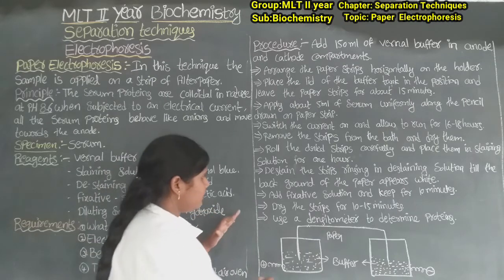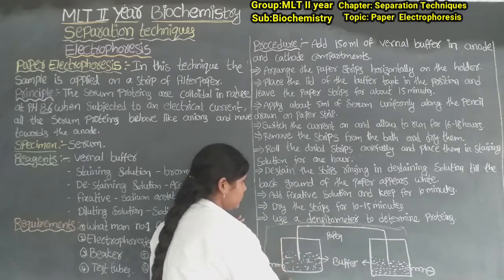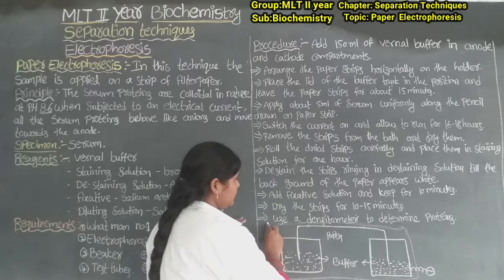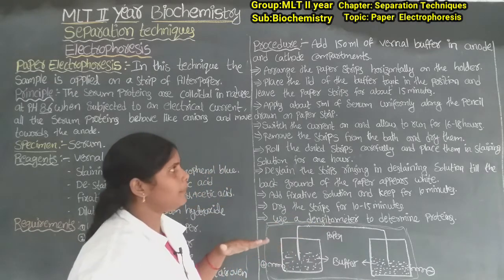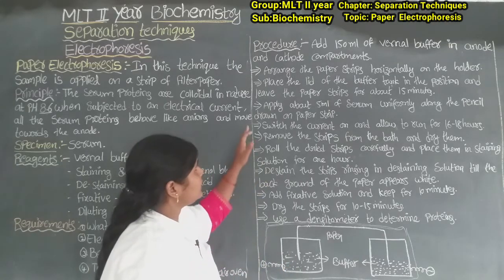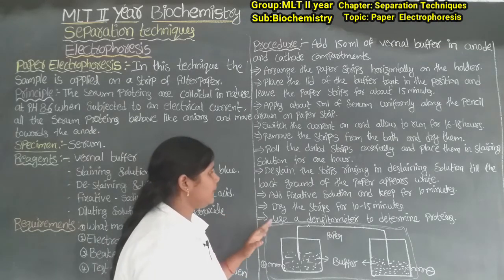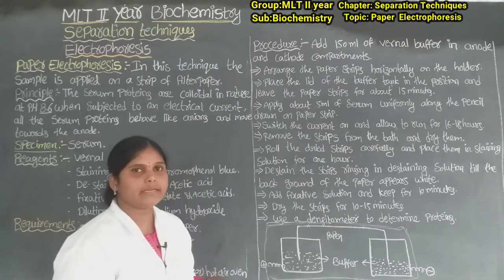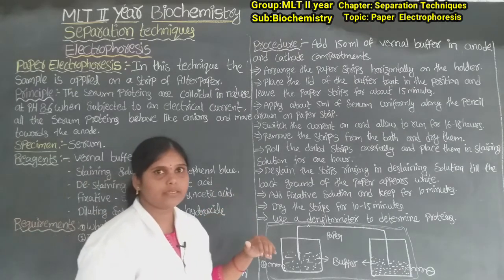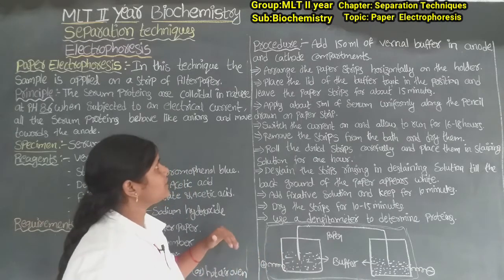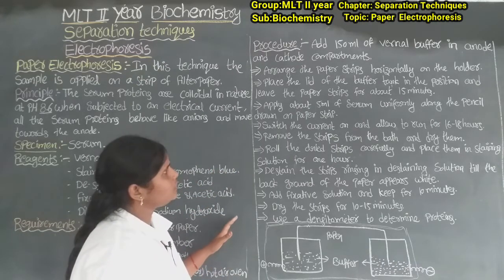After placing the paper, we close the glass lid of the electrophoresis chamber. We leave it closed for about 15 minutes to equilibrate. After that, apply about 5 µl of serum uniformly along the pencil line drawn on the Whatman No. 1 filter paper strip. Using the micro pipette, apply the serum sample on the paper. Then switch the current on and allow to run for 16 to 18 hours.